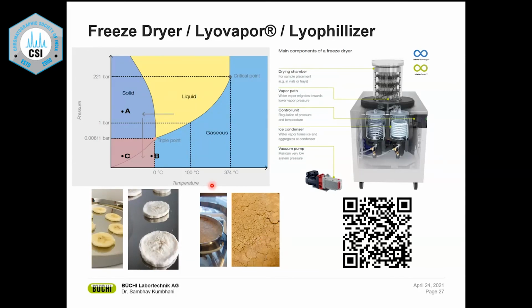However, I would say it is a slow technique. Sometimes it can take even 24 hours or 48 hours to dry one sample completely, depending on the content of solvent present, but it is very gentle. Your sample is never damaged, and you get a very good dried compound.